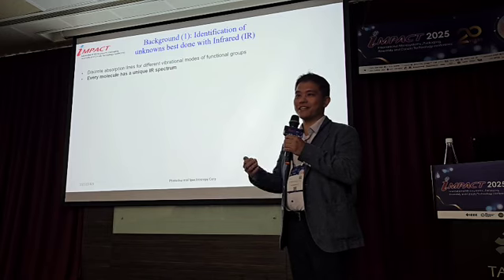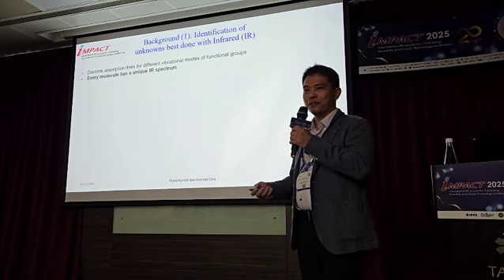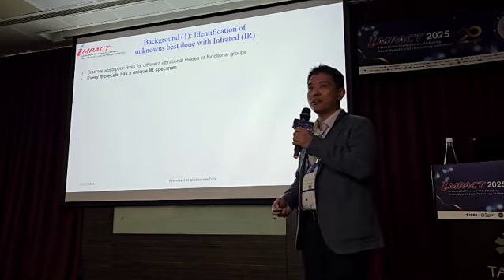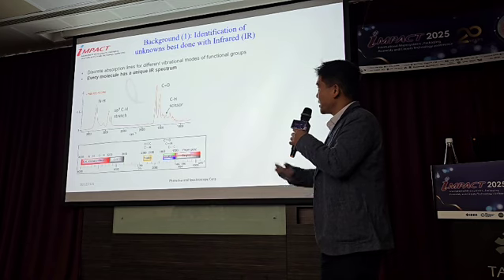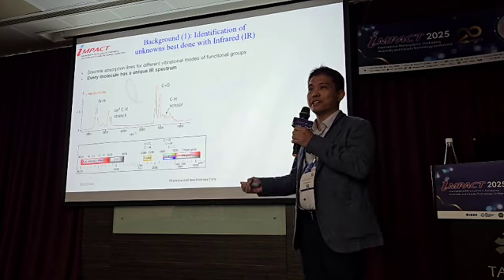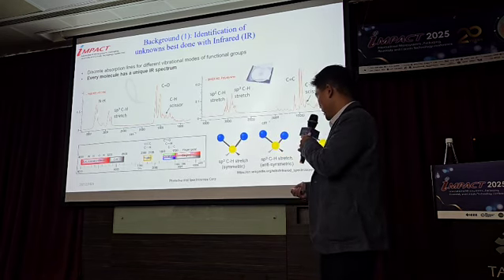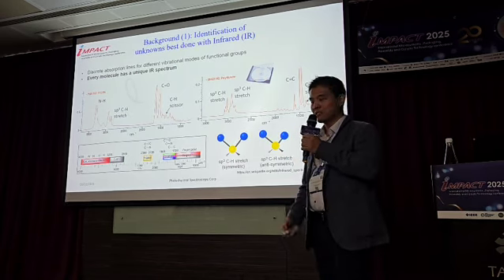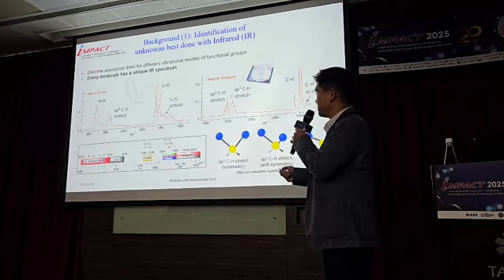Back in college, we learned how to interpret the spectrum: based on these functional groups, we can figure out what the molecule is, and every molecule should have its own unique IR fingerprint. That's why we can separate nylon from polystyrene, as a general example. Each of these functional groups has different vibrational movement, so based on these bands, we can tell what they are.